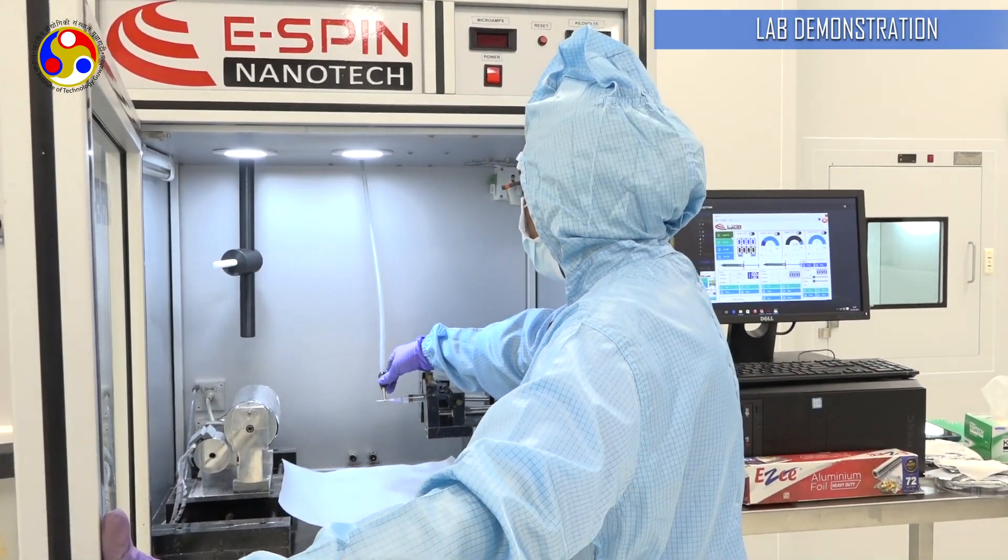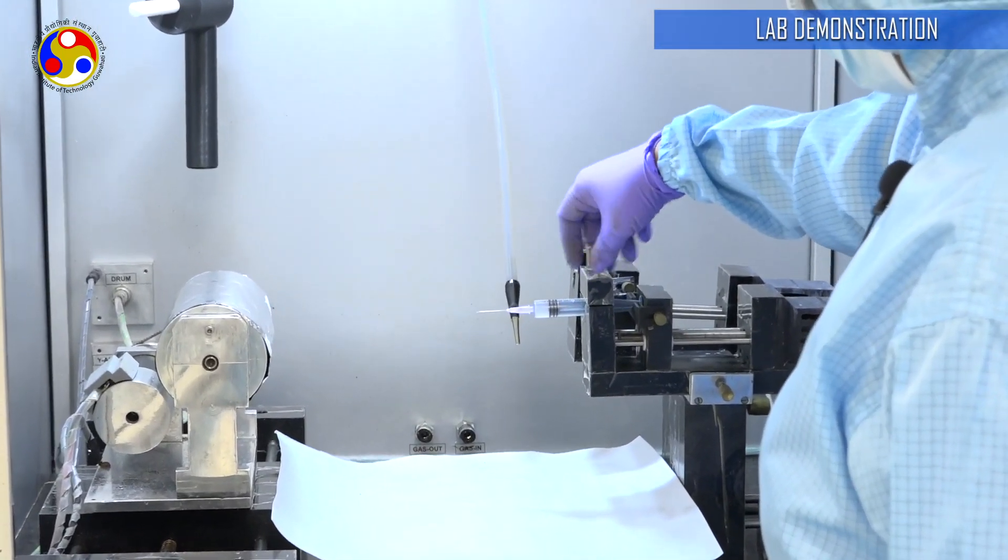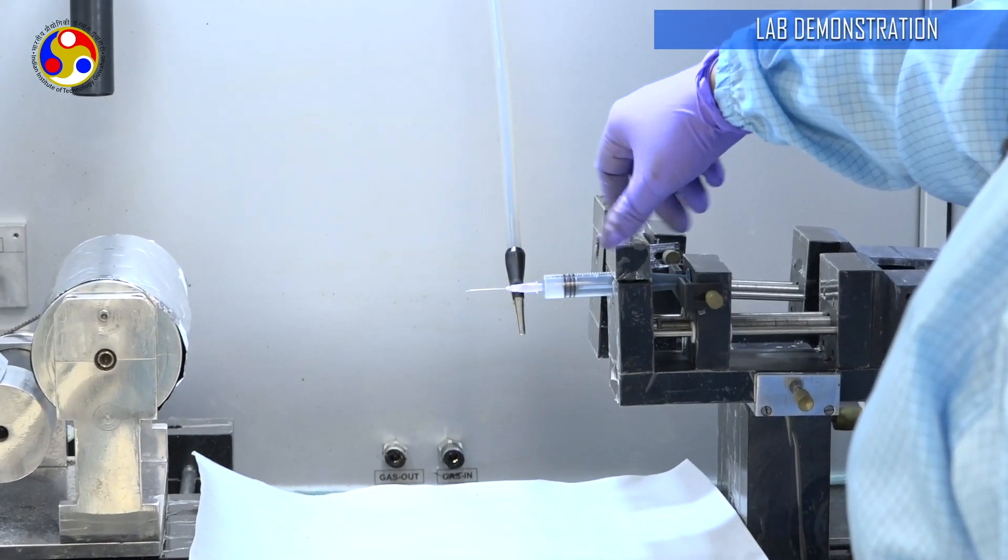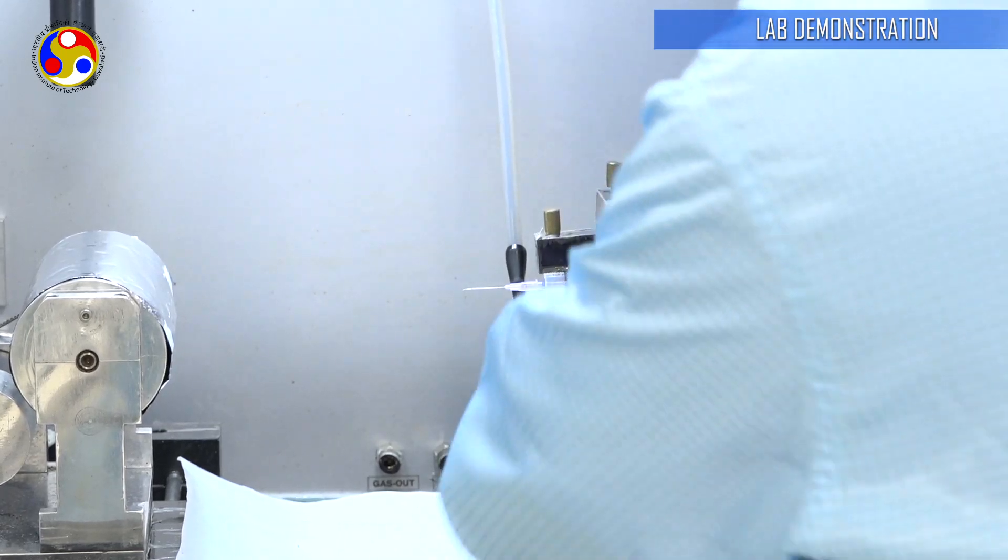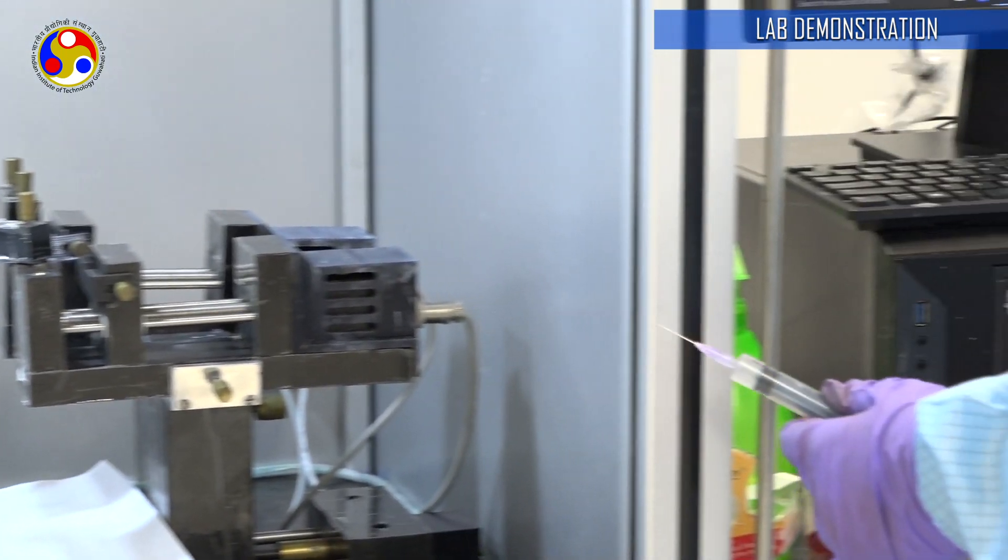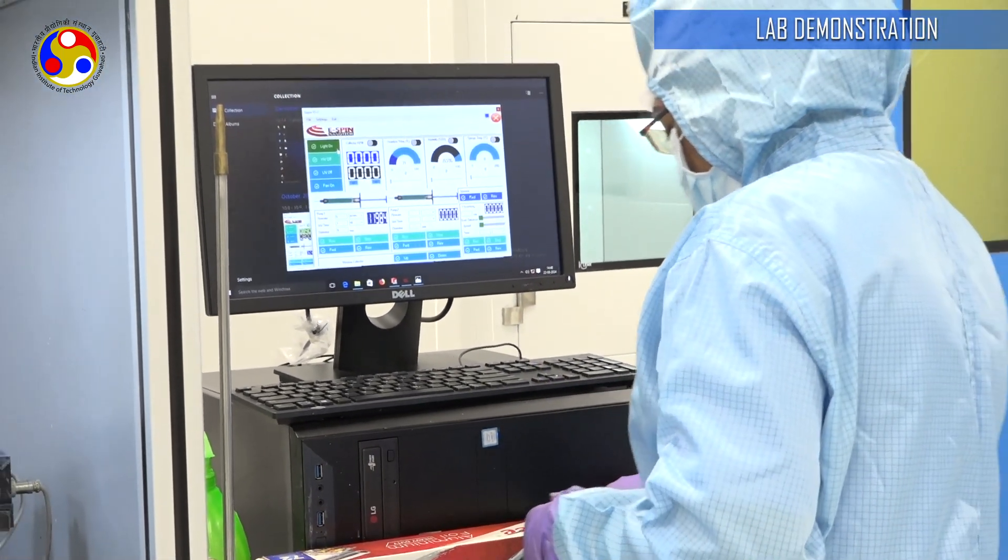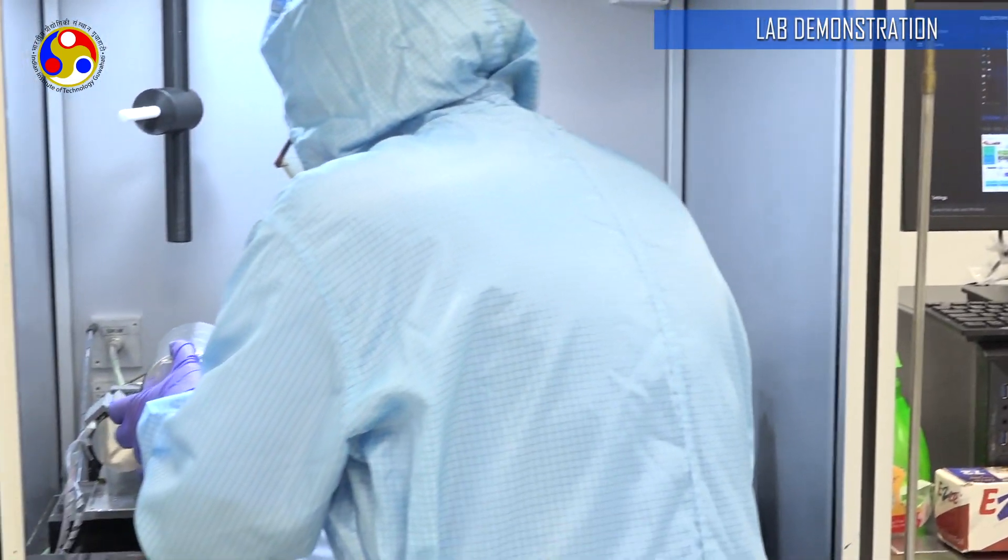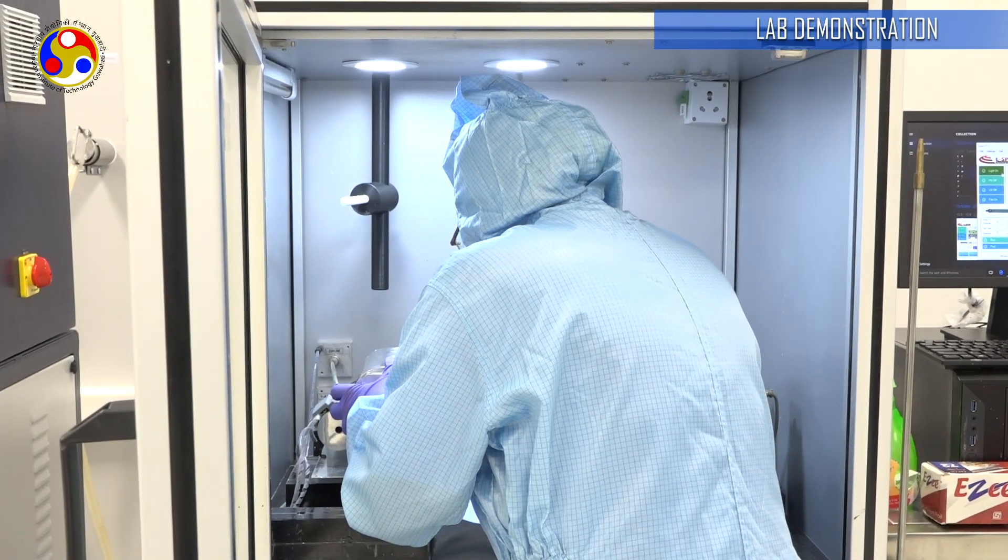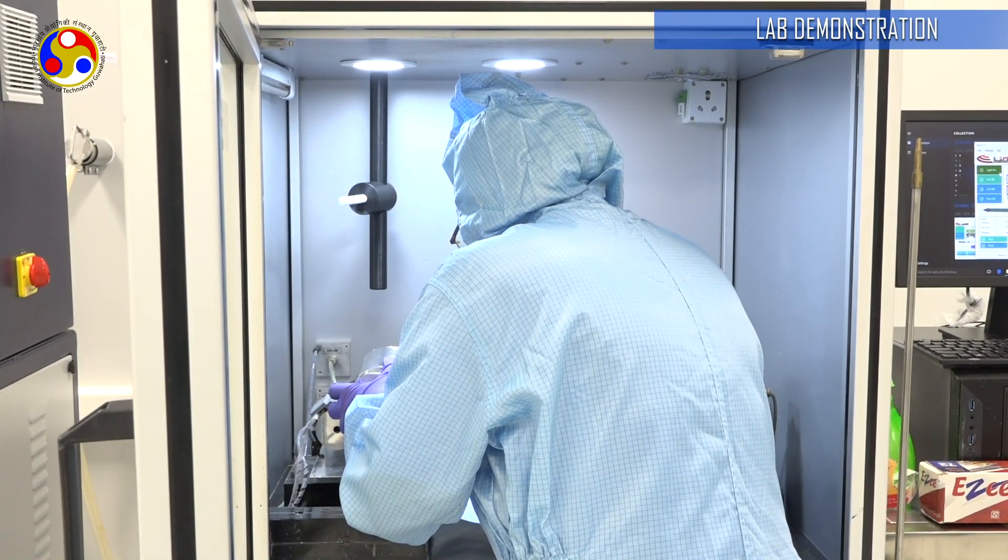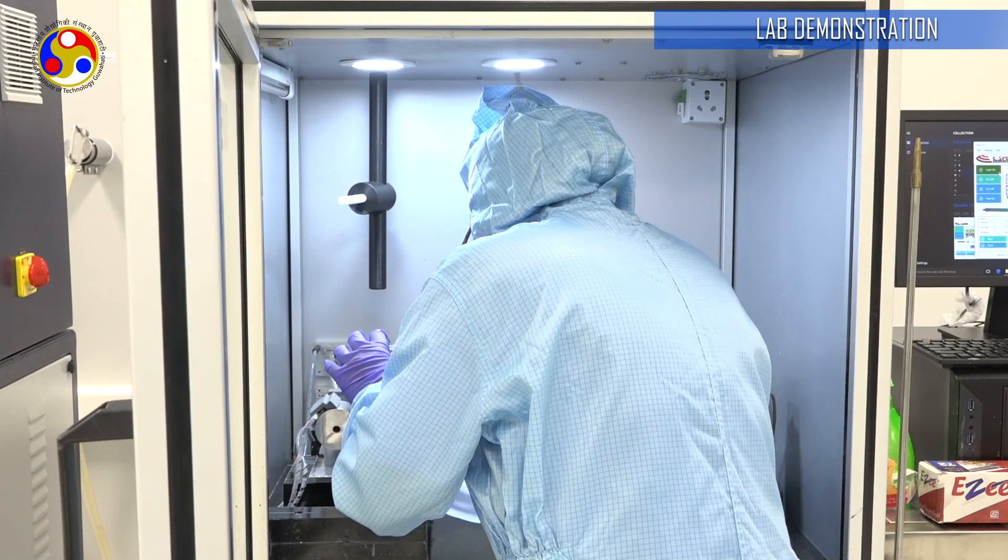Firstly, we are going to remove the cable from the syringe. Then, just going to put the cap on. Then, we are going to carefully remove the sample from the collector. This is just a demo sample, so I am not really going to exercise much caution here. But since the fibers are mostly very delicate, it is important to handle them very carefully.